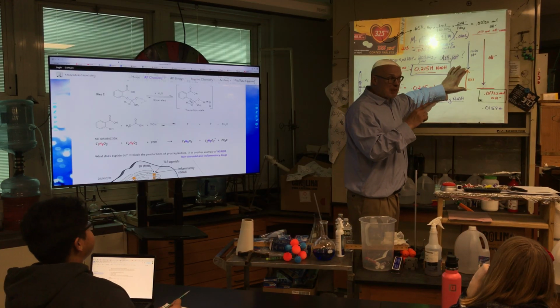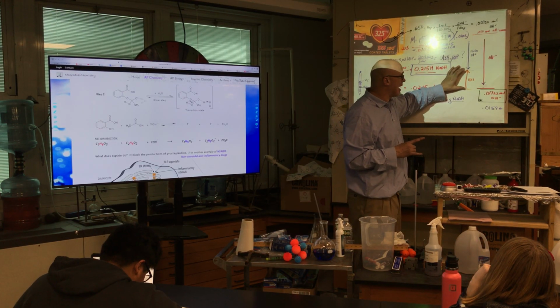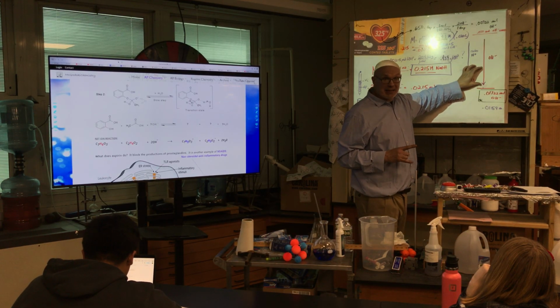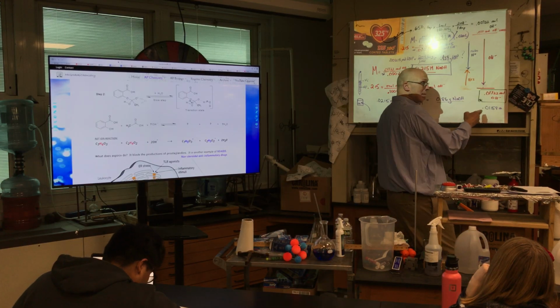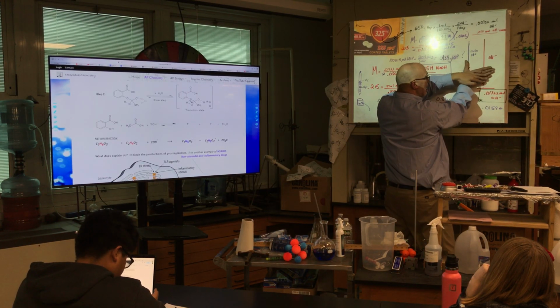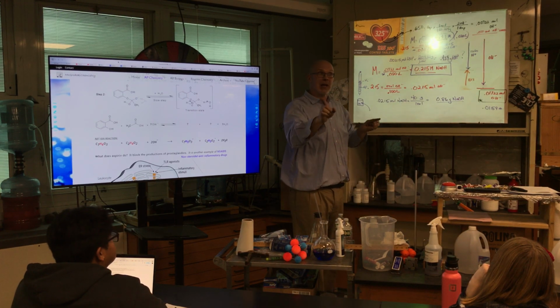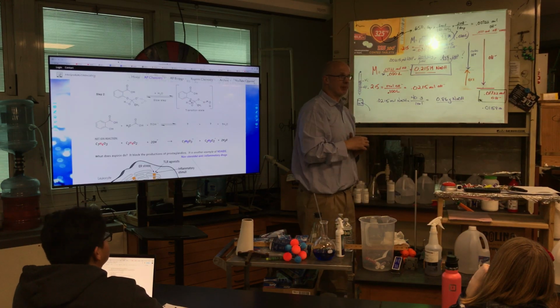That's the same, H plus equals hydroxide, so the moles of HCl I need to back titrate the excess is equal to the excess hydroxides. I've got to take that mole and subtract, not this overestimated number, but the actual number to get how much was needed, and I go backwards. So just like last night, we have to adjust this line going down.